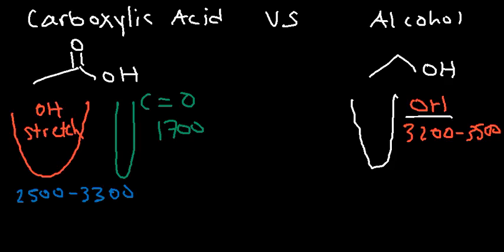Now, there are some other signals in the fingerprint region that could be useful, but the presence of these signals, it's not always a perfect indicator. It's not always reliable, but I mean, it is a decent indicator.